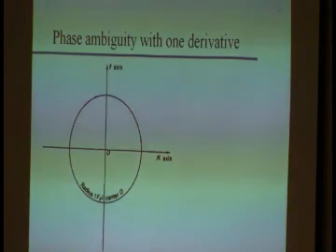So you know that your Fp has to lie somewhere on the circle, but you don't know where. 360 degrees of options. Well, we then grew that heavy atom derivative and we located that heavy atom, and we can actually assign a phase to that FH, because if we know the position we can calculate that.